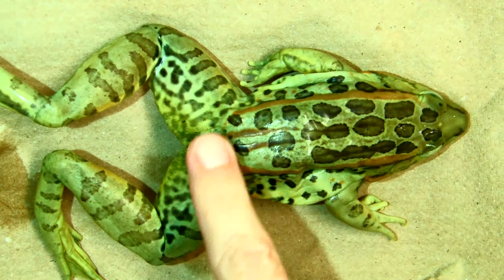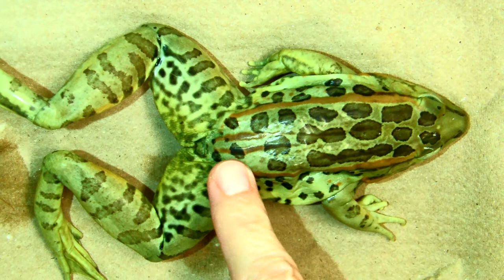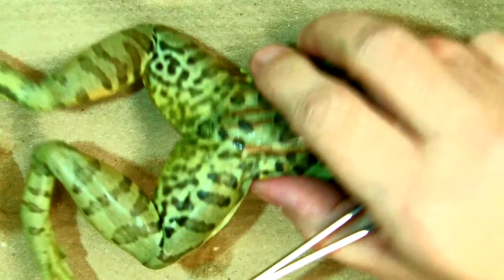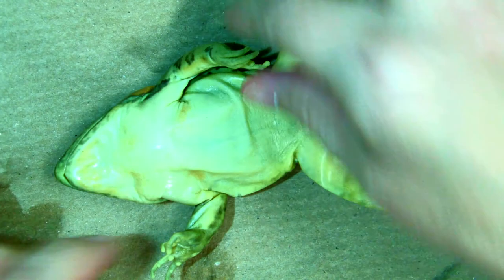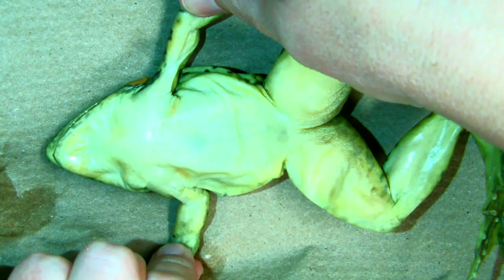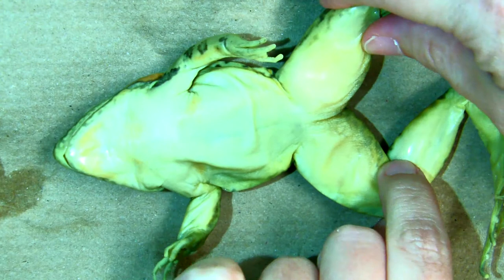This is the dorsal side. This is the ventral side. His forearms. His hind legs.